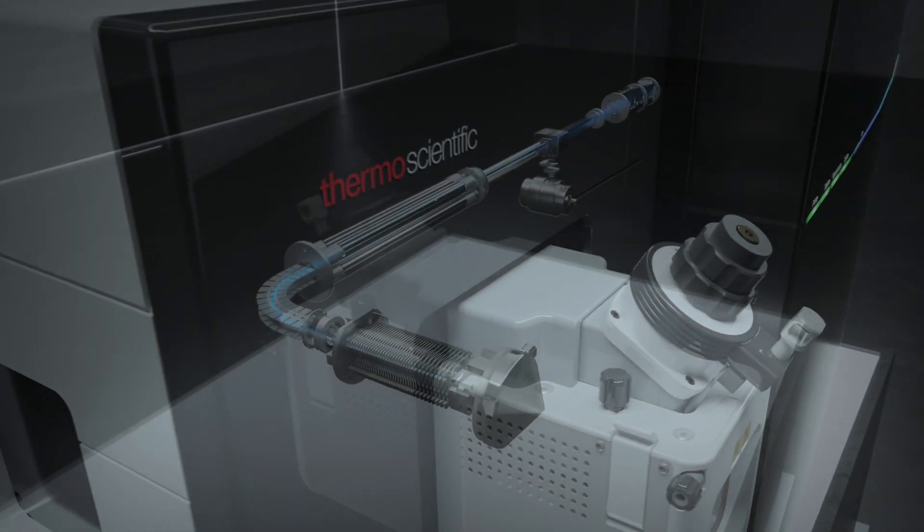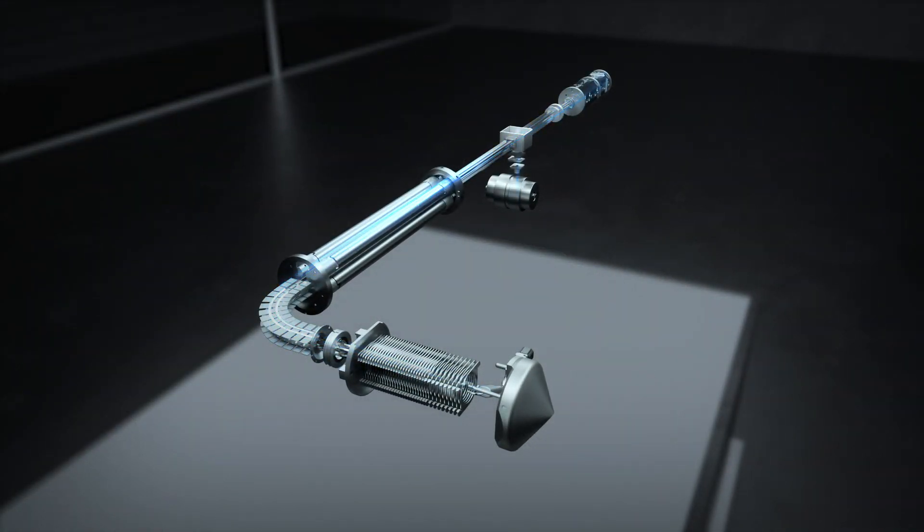The Orbitrap Ascend tribrid mass spectrometer uses a combination of the best quadrupole, linear ion trap, and Orbitrap mass analyzer technology to acquire the richest MSN data.